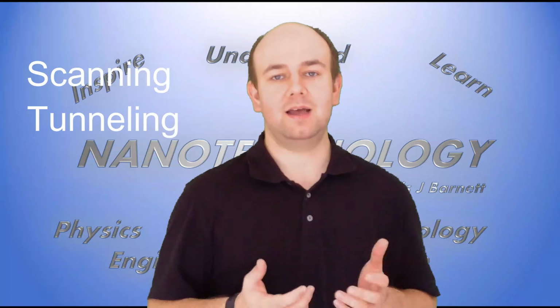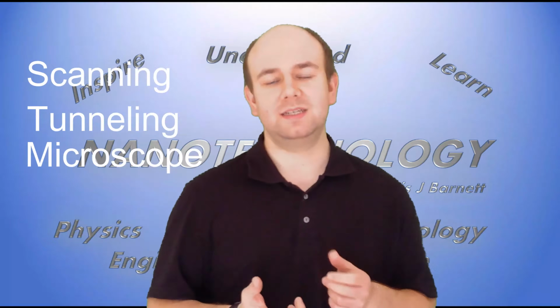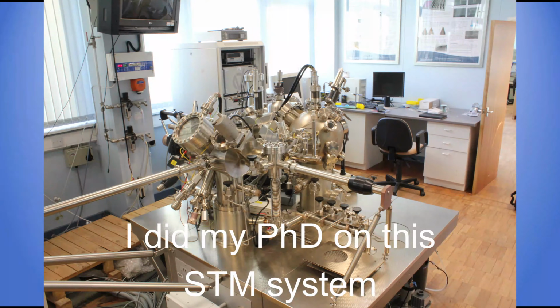One of the most common instruments associated with nanotechnology is the Scanning Tunneling Microscope. This instrument was invented in 1981 at IBM in Zurich. What this instrument allowed us to do was map out where atoms were in nanostructures, materials, and semiconductors.